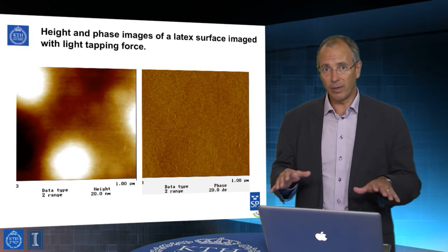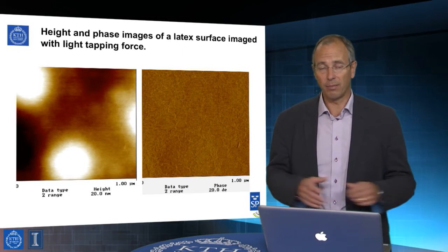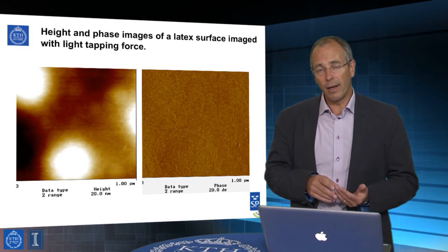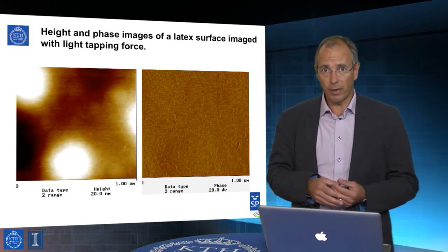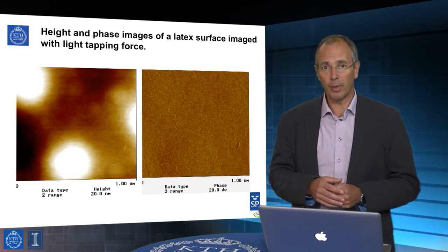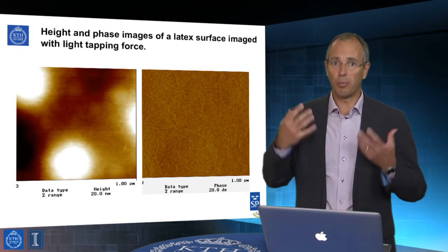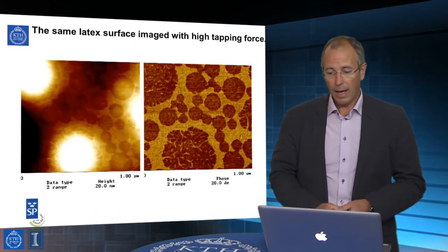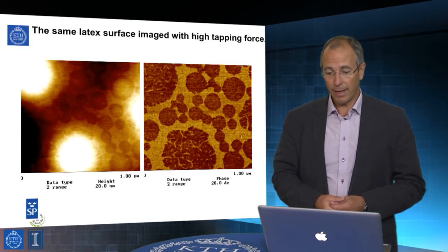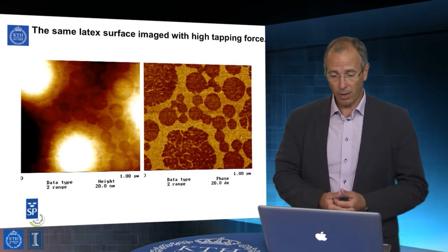Well, what we do have is obviously a thin film coating the surface, which is continuous. So in that case, the way to try and detect subsurface information is strictly that we're not limited to the absolute surface with AFM. We can detect subsurface properties. So we take our cantilever and we just tap a little bit harder onto the surface, so we're pushing more as we go in. And that's enough to then bring out the inherent contrast in the image, and we can see then where the different hard and soft polymers are located.